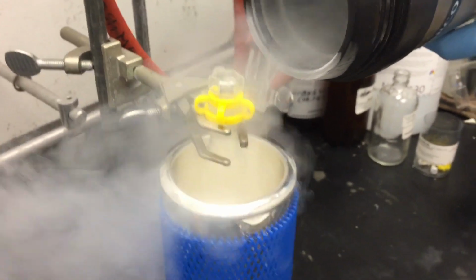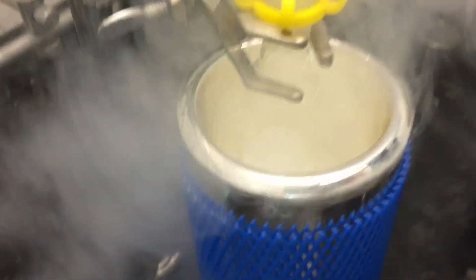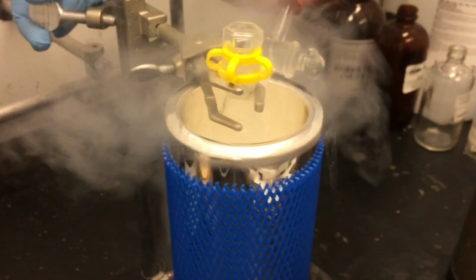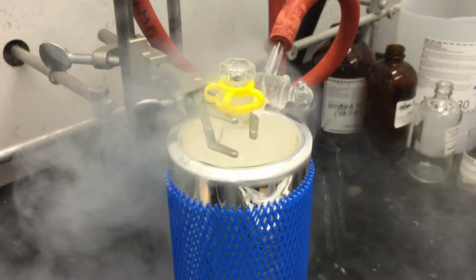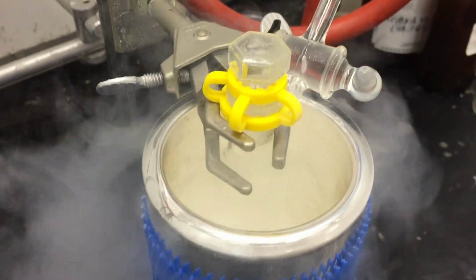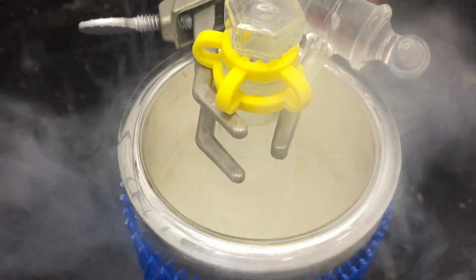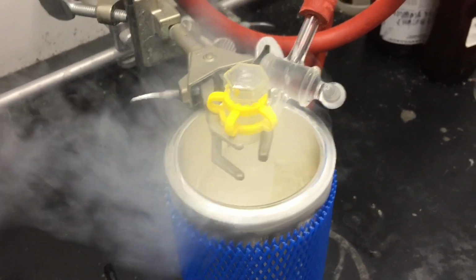Add a bit more, it's starting to come off. You may not be able to see, but if I were to pull up my solvent now, you can see that it is mostly frozen. Just a little bit longer. Our solvent is frozen. So now we're going to introduce it to the vacuum.